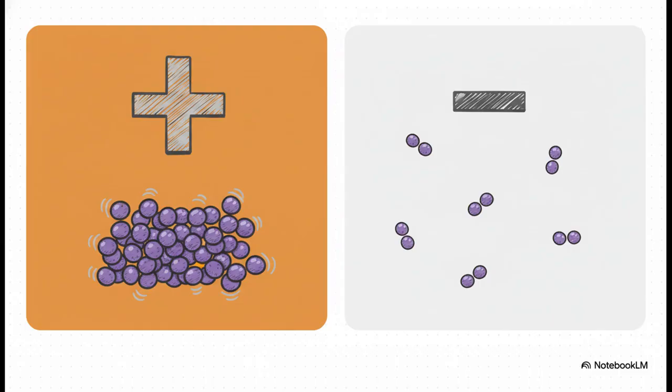In this slide, it shows you that fundamental split perfectly. The test literally divides the entire Staphylococcus family into two major groups. You've got your coagulase-positive S. aureus on one side, and on the other side, all the others, which we lump together and call Coagulase-Negative Staphylococci, or CONS for short. Making this distinction is absolutely key for figuring out the right treatment.